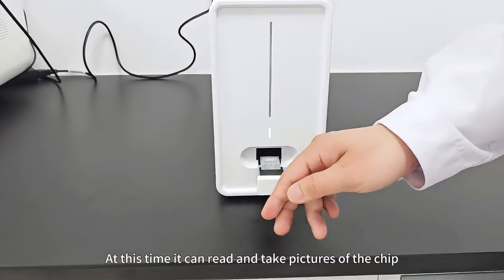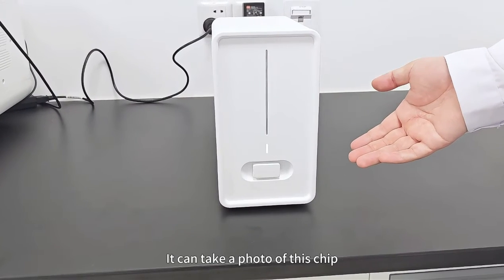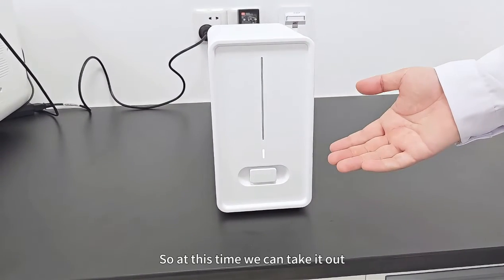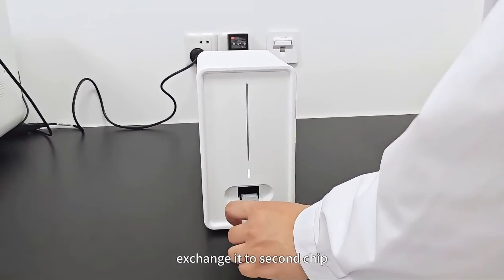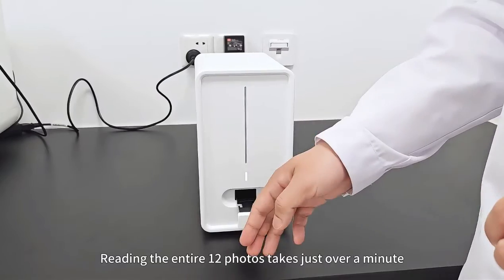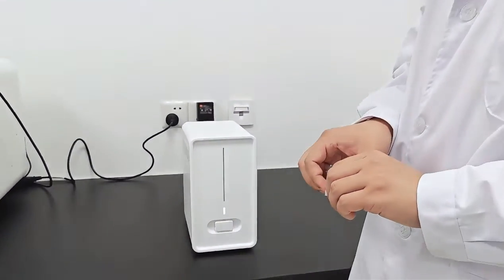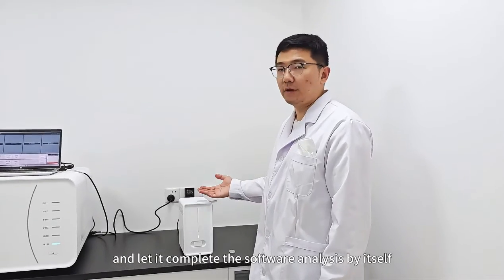At this time, it can take pictures of the chip, taking a photo in just a few seconds. So at this time, we can take it out, exchange it for the second chip, then put it in for reading. Reading the entire 12 photos takes just over a minute. Next, we can leave the instrument to complete the software analysis by itself.